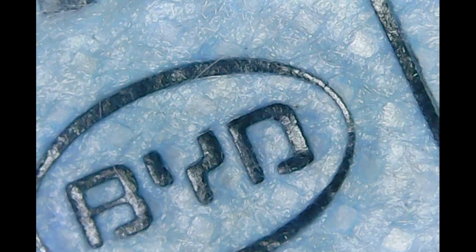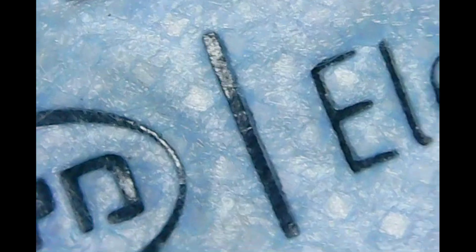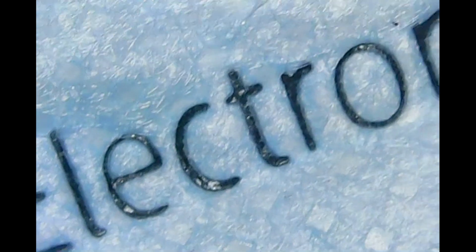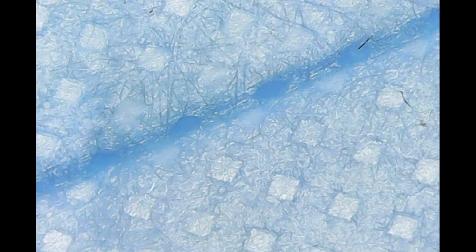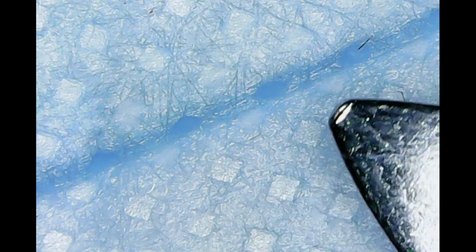Alright, this is the outer part. These are the words here, BYD, and here it says Electronics. Look at that. There's a bunch of squares here and this is the groove right here.